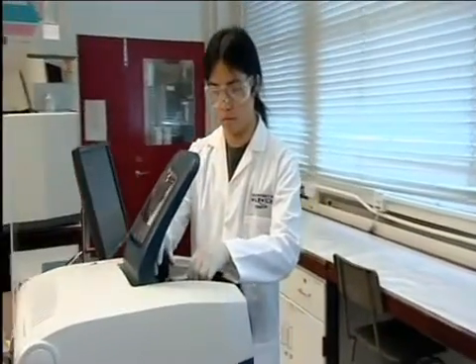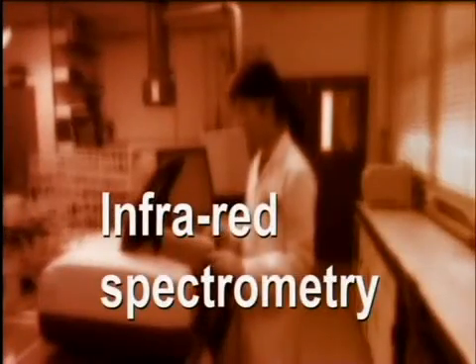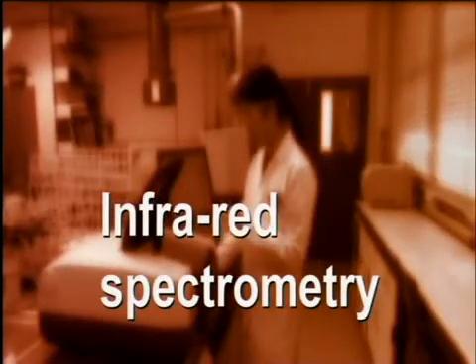Infrared spectrometry helps chemists to identify the functional groups present in a compound. It can therefore help in finding the structure of a compound.